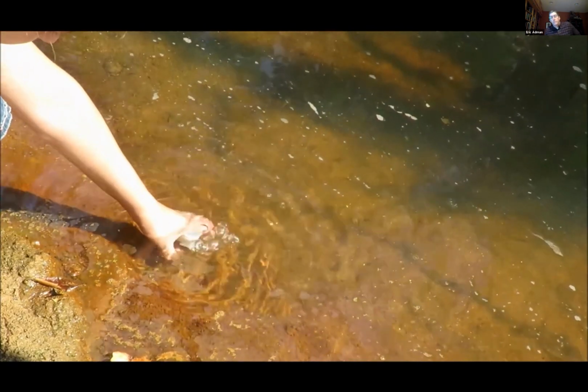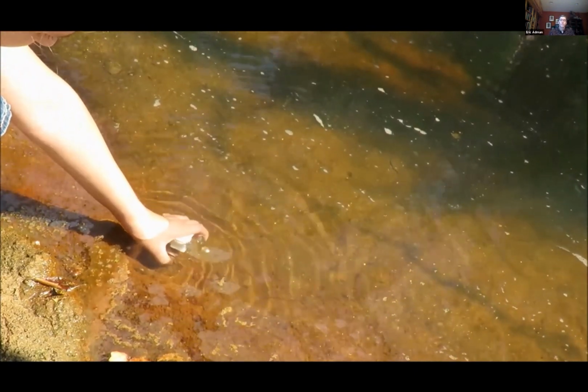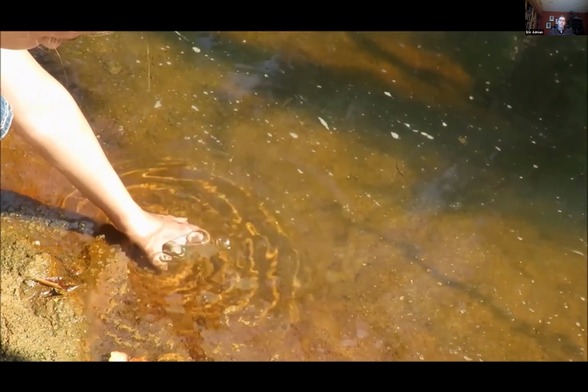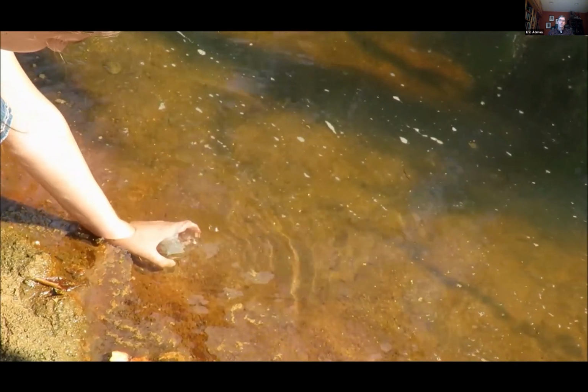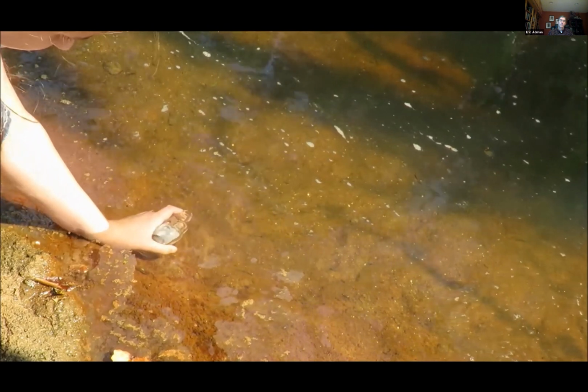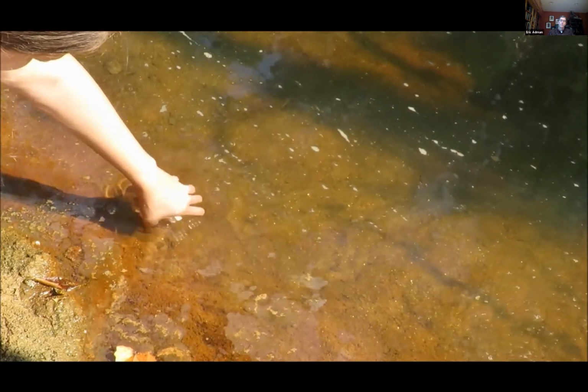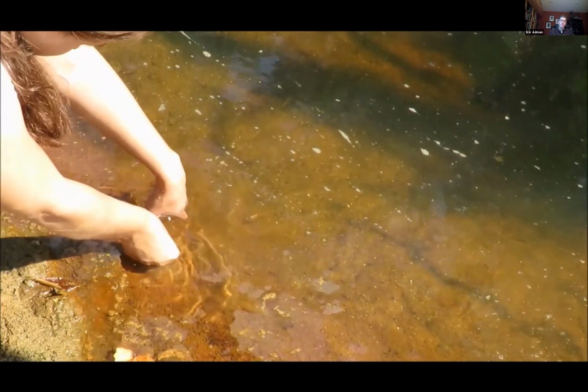To fill the bottles, hold them upside down in the same hand and submerge them below the surface of the water. Avoid disturbing the bottom of the stream. Allow the sample bottles to fill while completely underwater. Move or shake the bottles to allow all air bubbles to escape. Invert caps and cap the bottles upside down while they are still submerged.